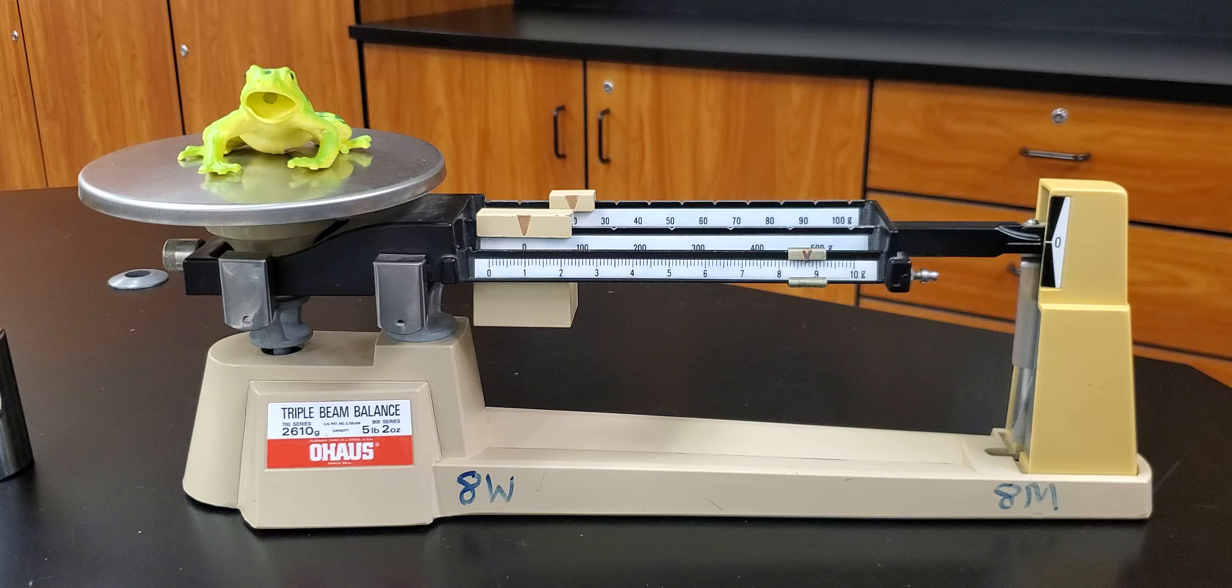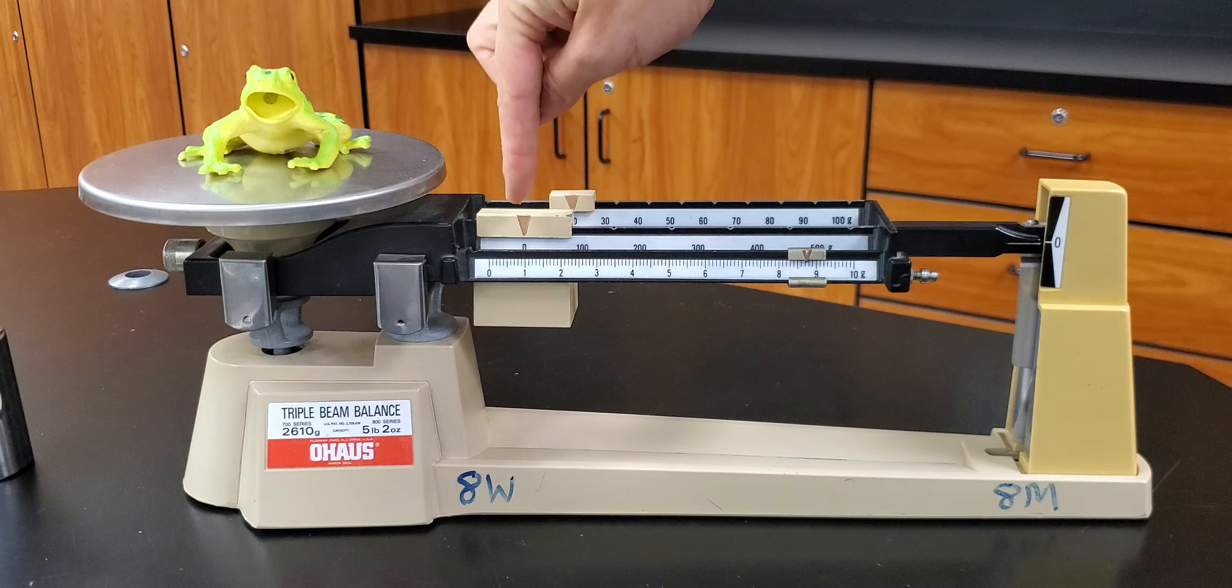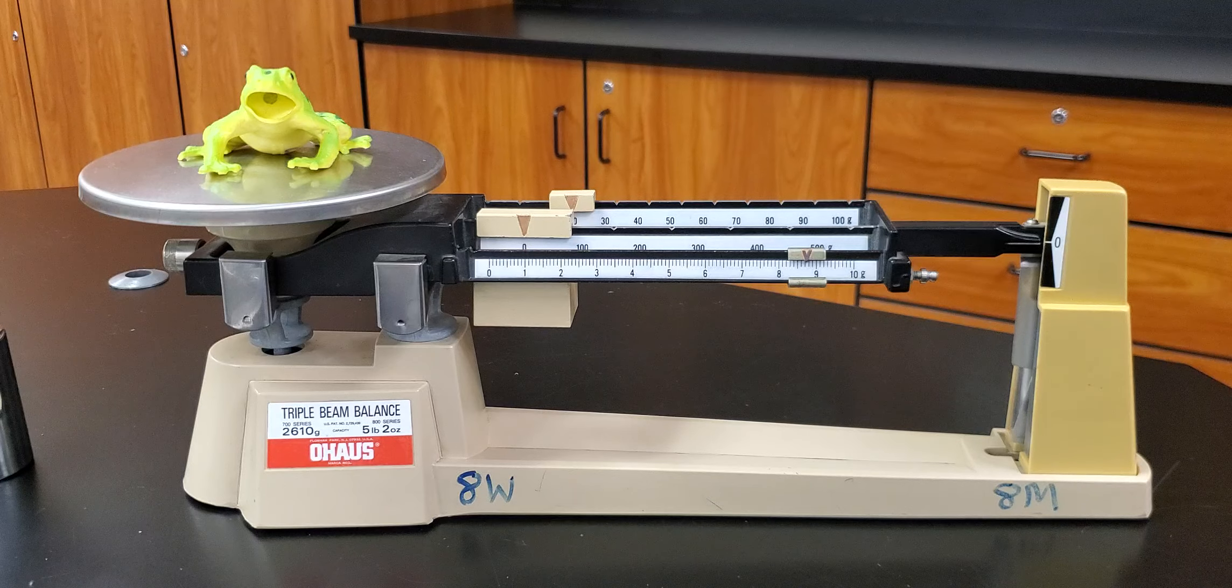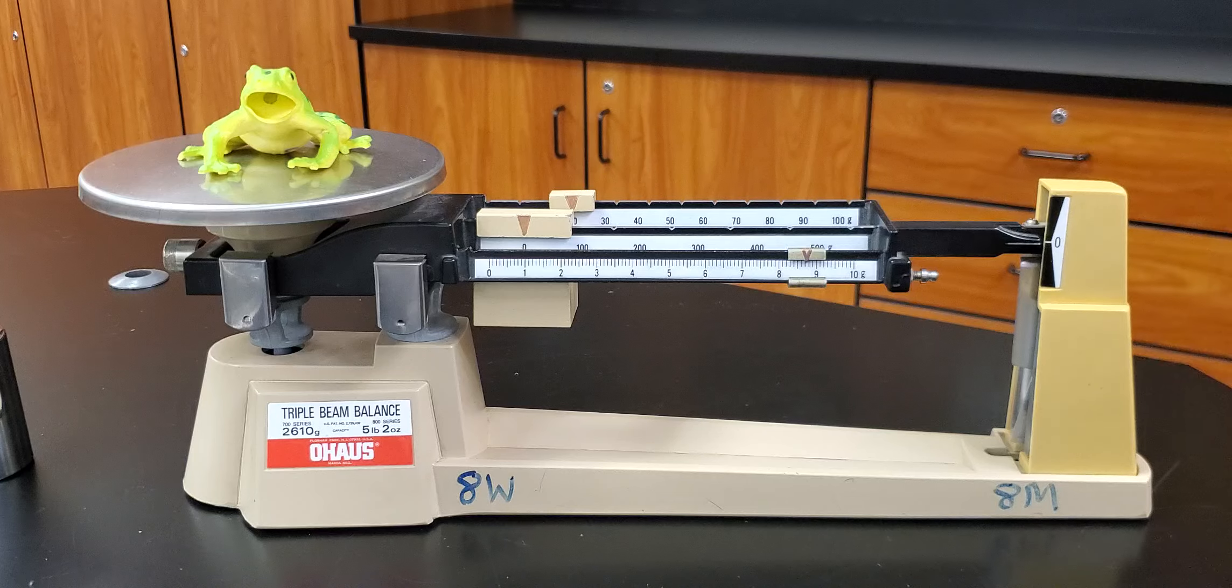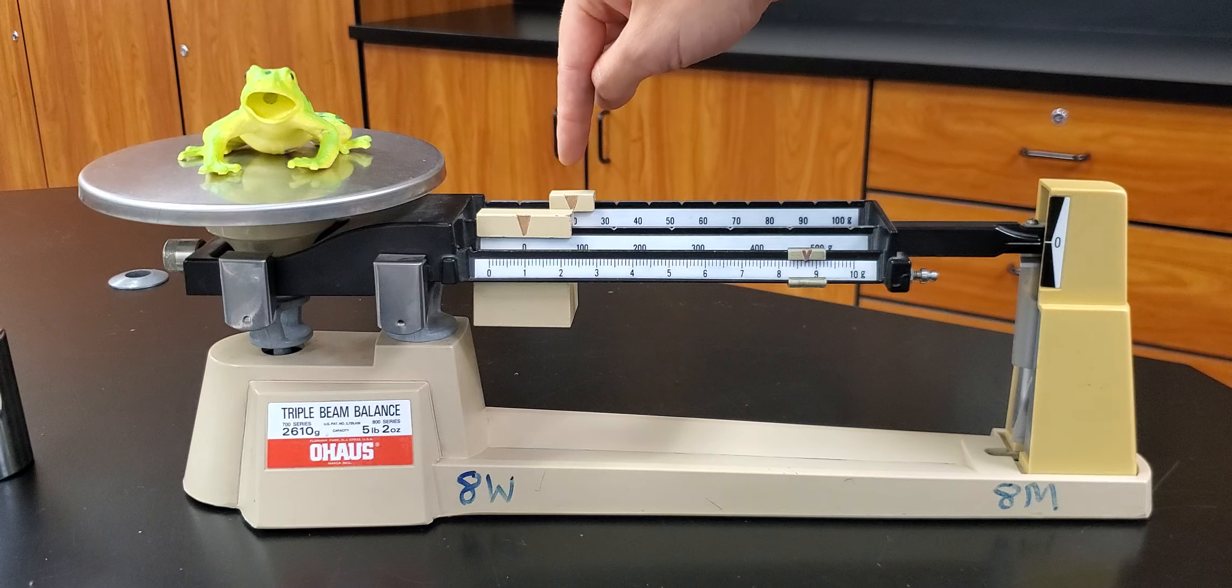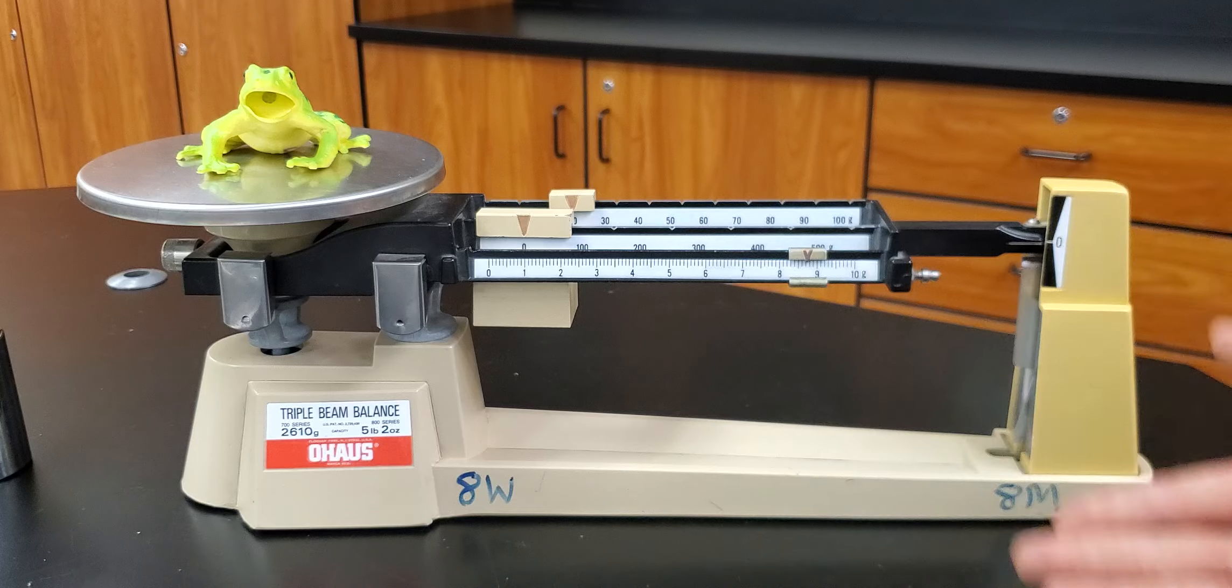Now we need to know how to read the mass that we've measured. So in the hundreds place we're pointing at zero. So we have less than 100 grams. But we do have a reading in the tens place and in the ones place. So in the tens place we're reading 20. So I know that my frog has a mass of 20 something.